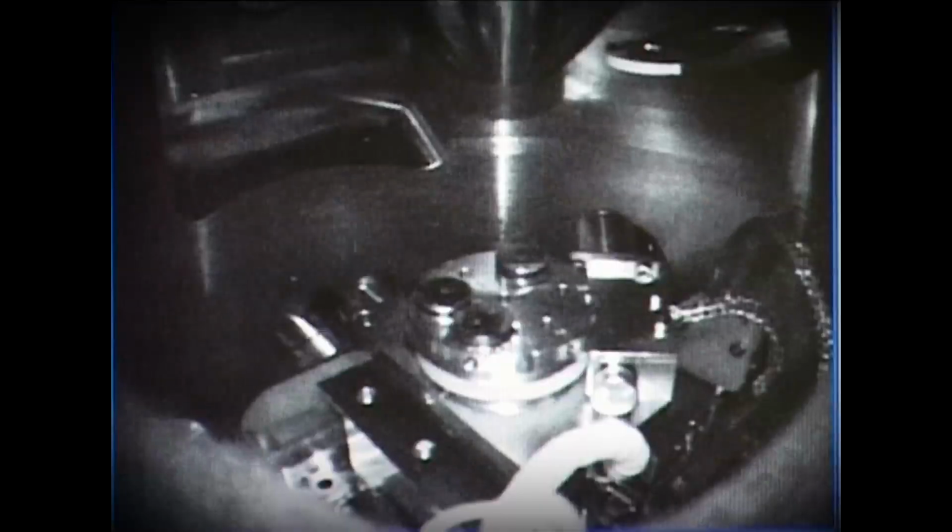Now, let's take a look at the scanning electron microscope or the SEM.